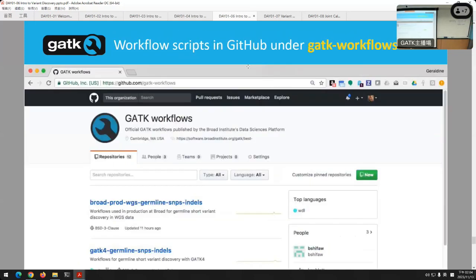Okay, so I think we are done with the overview here. I just want to say that almost everything we have should be present and available for you in GitHub. You should be able to take a look at this. Again, you have access to all these slides. So if I go too quickly, just go back to the slides and look at them on your own time. You don't have to write down web URLs right now. You can always go back to these and look them up.